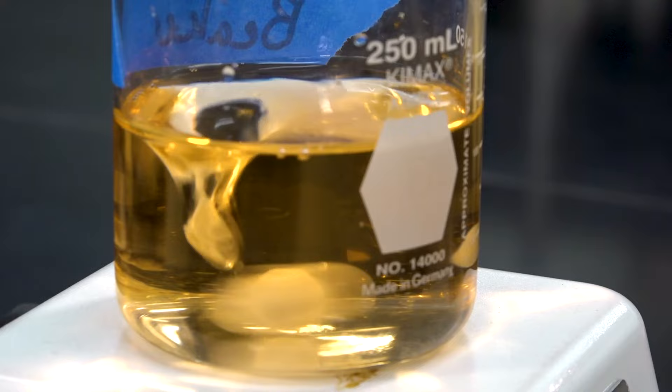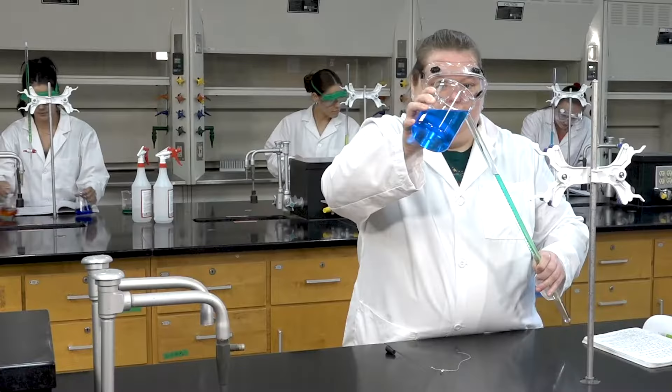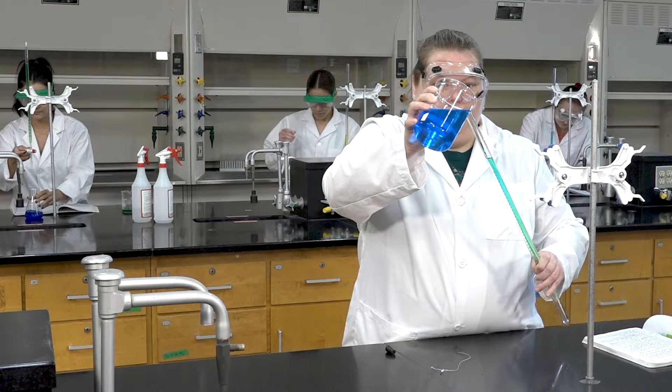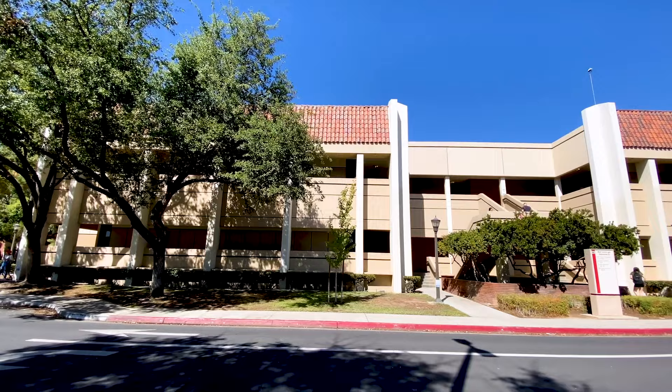The chemistry laboratory is an exciting learning environment, but also a potentially dangerous place. We handle caustic chemicals, flammable materials, open flames, and sharp glassware. Safety is of the utmost importance in any lab course and is everyone's responsibility.